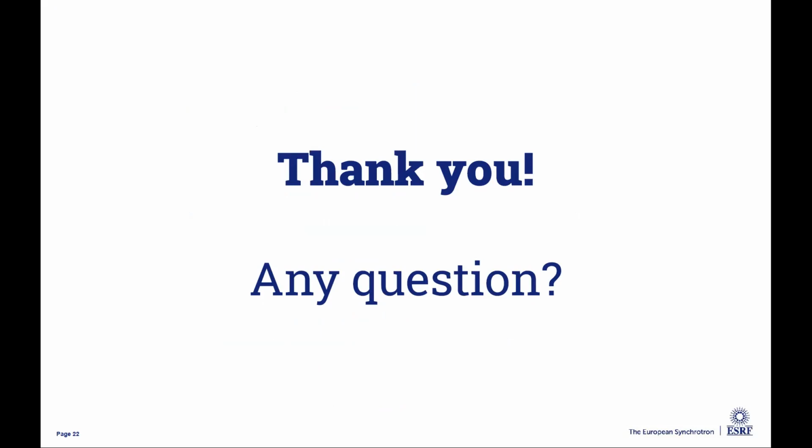Yes. So we analyzed the different possibilities for creating an API using Python. We saw that there were other possibilities like Flask. The conclusion was that they are all very good solutions, and we chose to use FastAPI because it is an all-in-one solution. We get lots of different very useful features like data validation and documentation, and everything is already included, so that's less development to do to make everything work together.